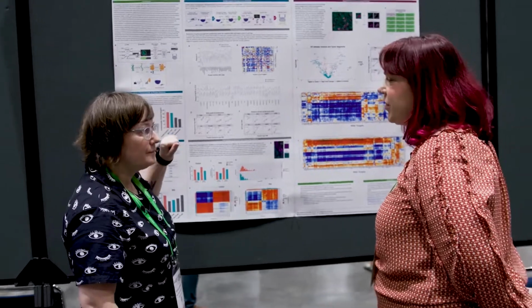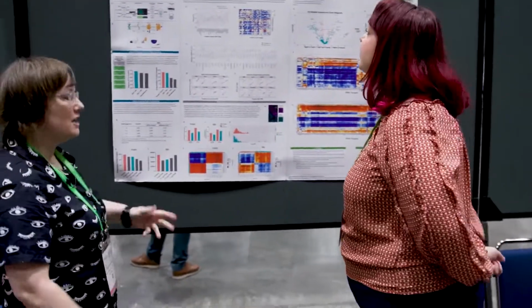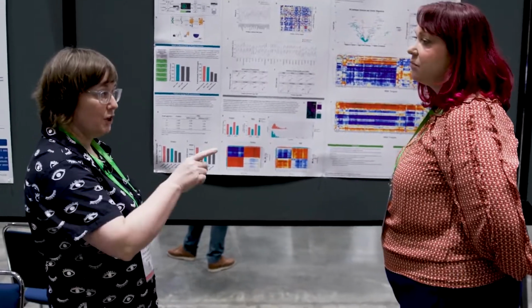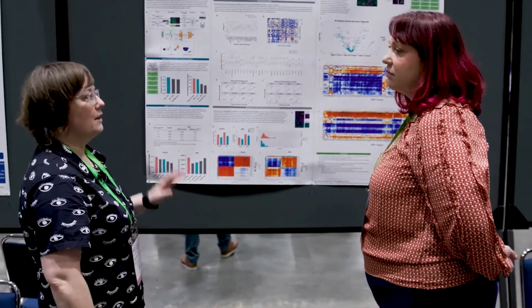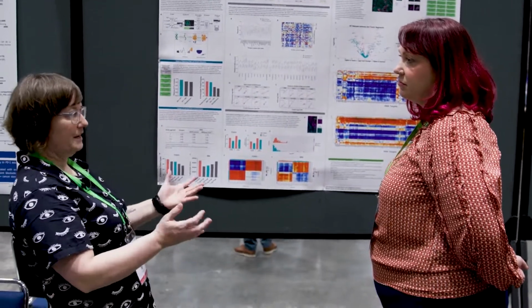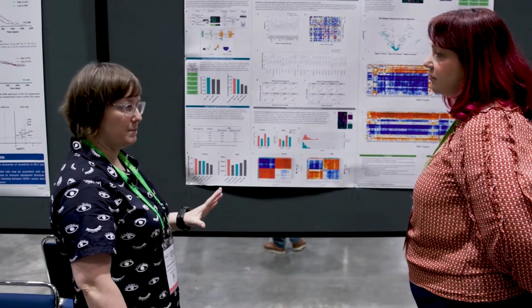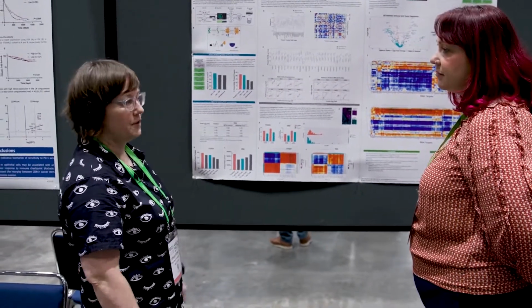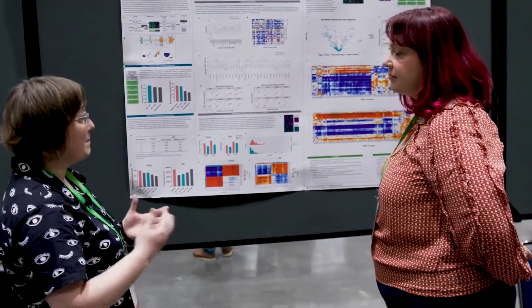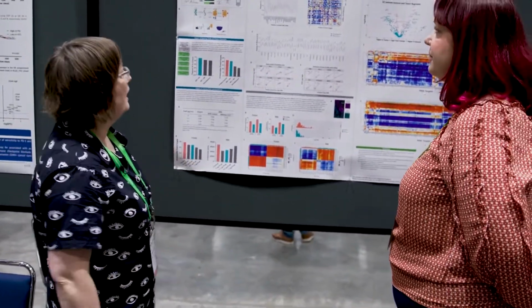And this is with the Whole Transcriptome Atlas or Cancer Transcriptome Atlas? That is a very good question. Yeah, you could do this with WTA, human or mouse, and then we also have CTA. So we just tested this on mouse content, and it's working. All this information shown here is dealing with FFPE. We also tested on fresh frozen. So we're trying to make it as compatible with many different sample types.